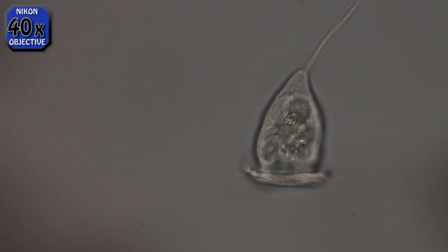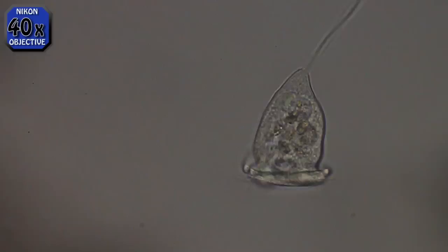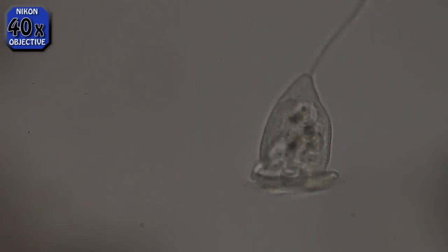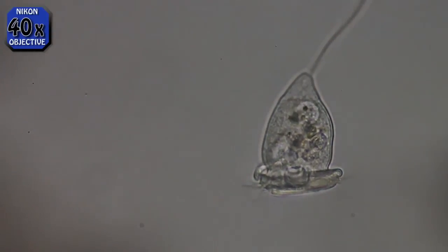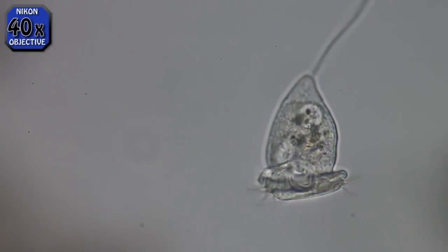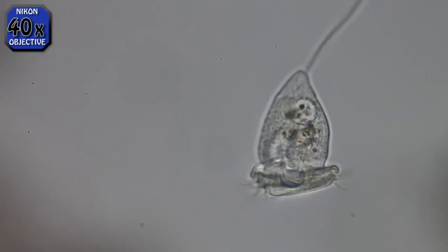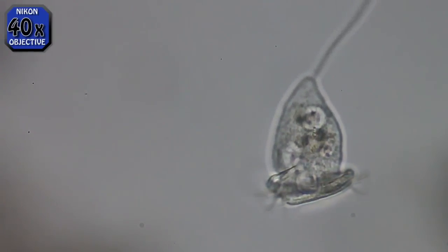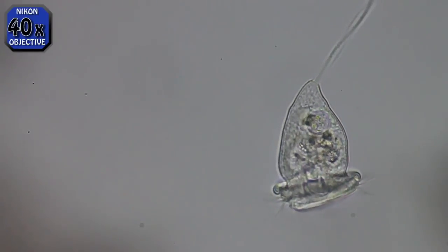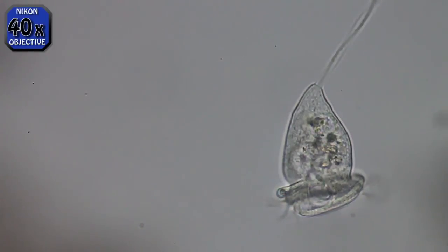Now we're at 40x using a Nikon 40x Plan Acromat bright field lens. Look at the rim around the bell — does it look like a coil where the bottom starts? The bottom edge starts and then coils around and goes up like screwing a screw thread. They all look this way.